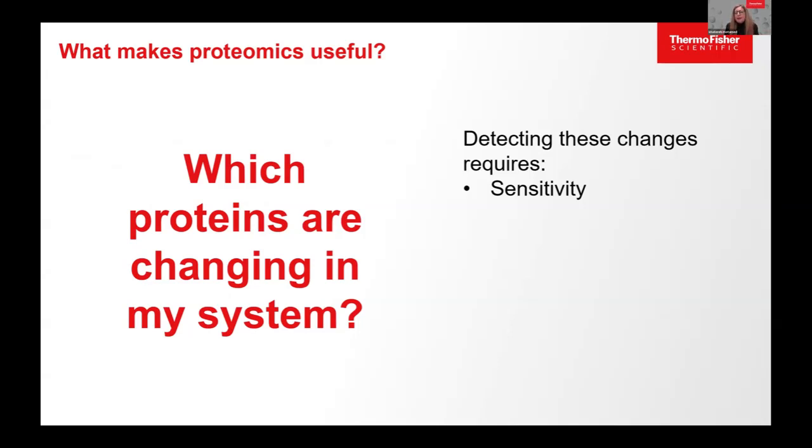To see these changes accurately, we need mass spec measurements that are sensitive, with really great depth of coverage, and that are consistent. The readout needs to be consistent.